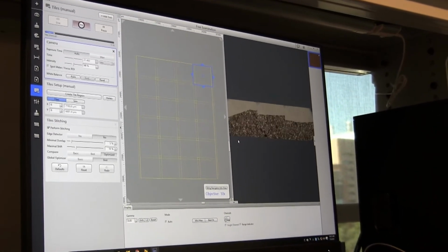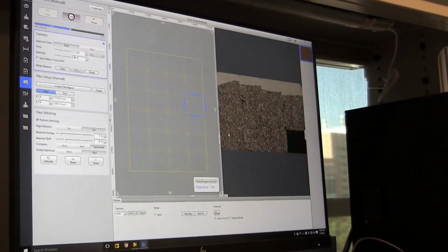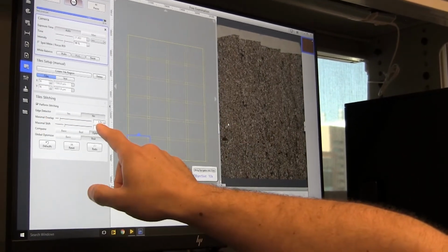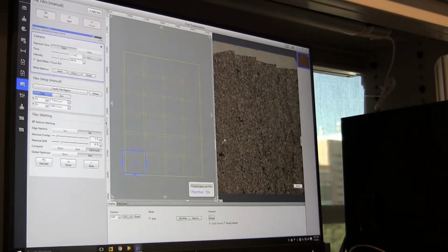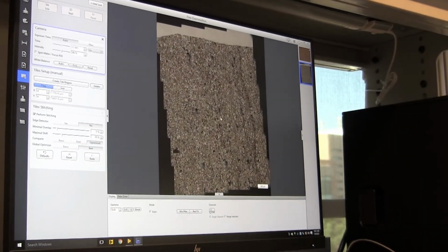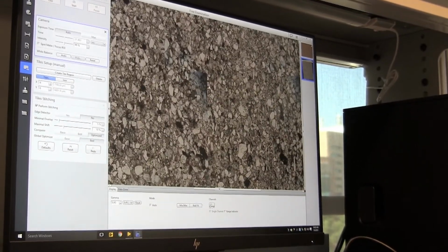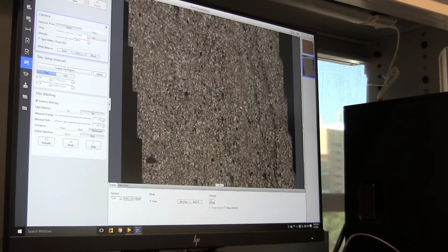It will start collecting the tiles and stitching them. First it will collect them in this way, and then when it stitches everything, there will be a percentage of overlap, and as you see here, minimum overlap is 5%, and then it will process all of that and mix them together, and you have only one big picture. Yep, this one is after processing. If you have something like this, I think this is probably because of the piece of dust that we have on the polarizer.